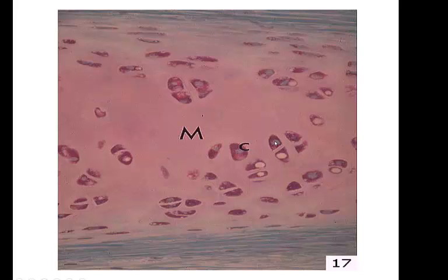So here's our chondrocyte. And the chondroblasts, those are the cells that make cartilage, when chondroblasts are making cartilage, they get trapped after they make this solid background matrix here. They get trapped in a little cave called a lacuna, and then they convert from a chondroblast to a chondrocyte. So here's a chondrocyte, here's a chondrocyte. It's actually the nucleus of a chondrocyte, but they're trapped in these little caves. And when two chondrocytes get together, they remind me of a set of eyes looking back at you. So I call them owl eyes. I don't know why. Like owl, like the animal.